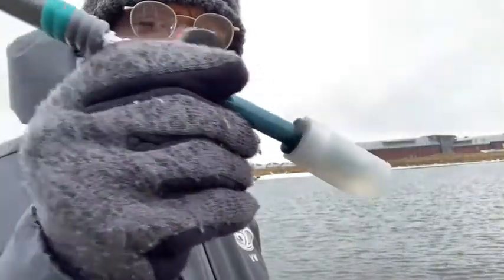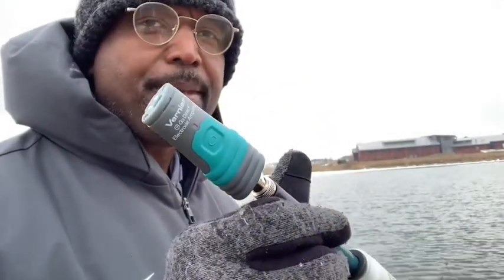Okay, so the next variable I'm going to measure is the pH of the water. Recall that in Unit 2 we talked about pH. It is a measure of acidity or basicity of water, and so we recall the pH scale: 0 to 14. 7 is the neutral point. Less than 7 is acidic, and greater than 7 is basic.